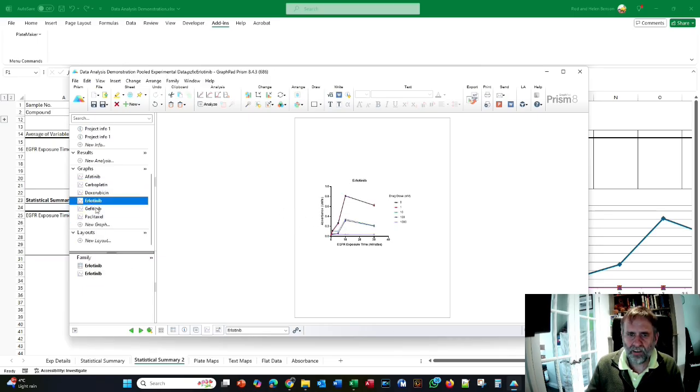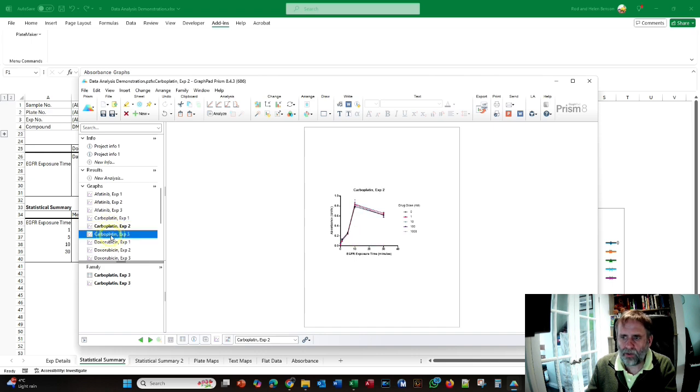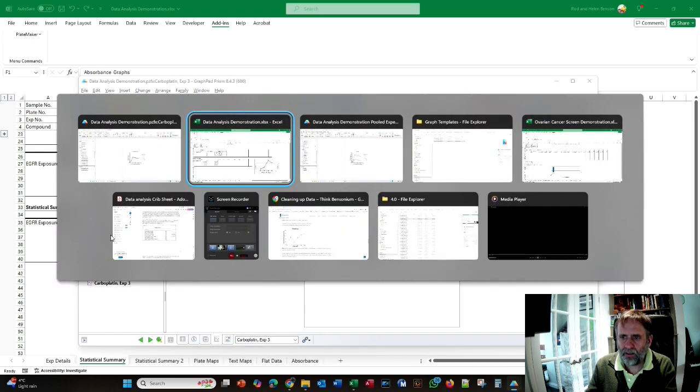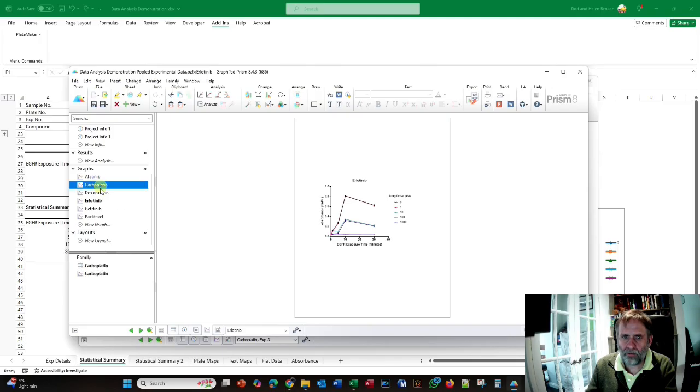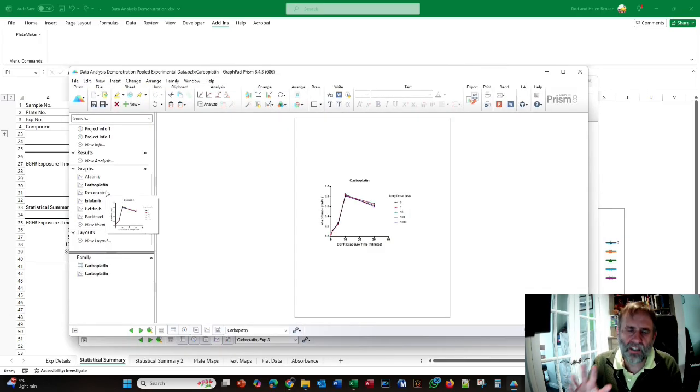Obviously it looks very similar to the individual experiments as this experiment was very well behaved, but you get the idea. If we compare that file to the one before, you can see the difference here. We have the different experiments and the mean experiments. Let's just compare those two directly. So you can now see how you can slice and dice the data differently to get whatever view of the data you want, whether you're doing the individual experimental data or the mean of the experiments.